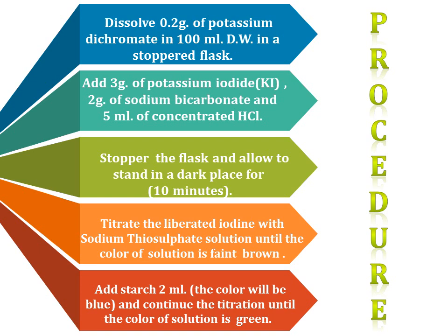This means the produced iodine reacts with sodium thiosulfate solution from a burette and is converted to sodium iodide, a white salt, as we mentioned in the second equation in the chemical principle. So the color of solution changes from dark brown to faint brown. When the color of solution is faint brown, stop the titration.